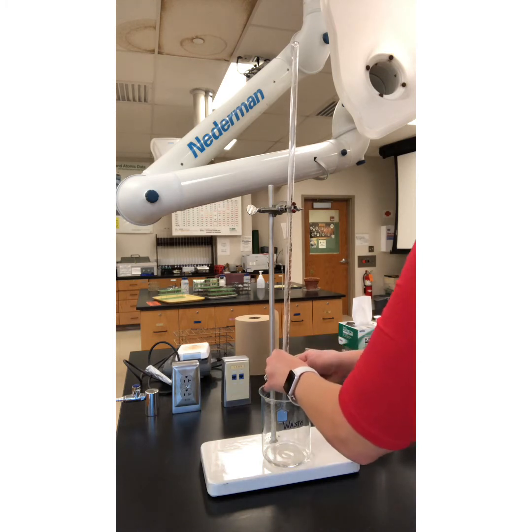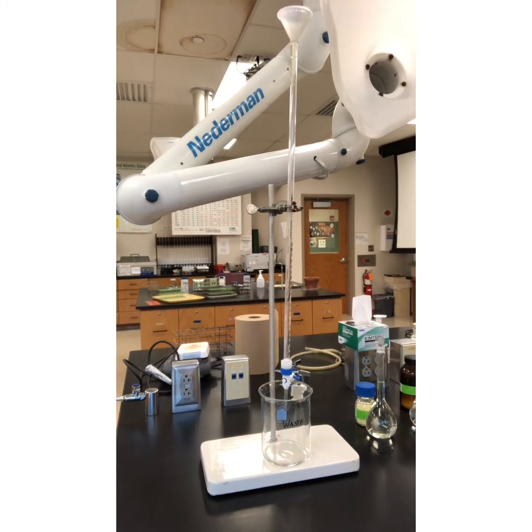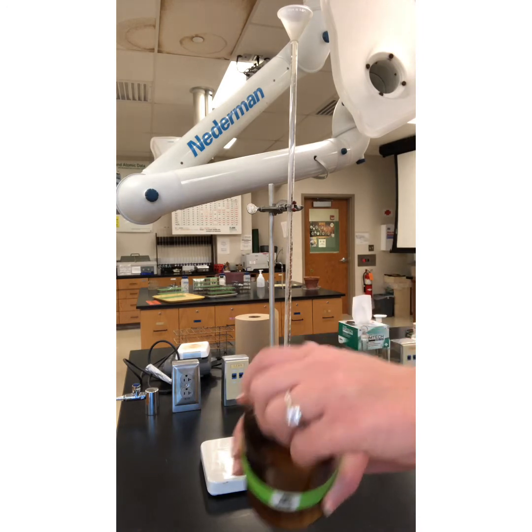So I'm going to close it. I don't want my solution to run through just yet. Okay, I have placed a funnel up in the top to help me make sure I don't pour my solution all over the place. Oh, did I forget to show you? Here, sorry, I think I did.